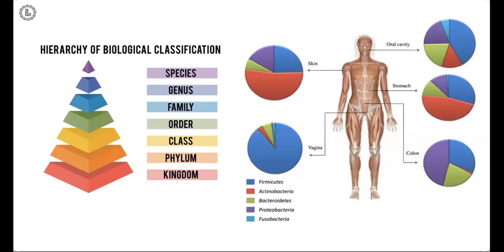Or sometimes, for the kind of data we are analyzing, we might have most of the taxonomic ranks characterized. Then we can go to a higher resolution like the family level or even the genus level. But practically, the genus level and species level are going to be extremely difficult because of the difficulty I mentioned.